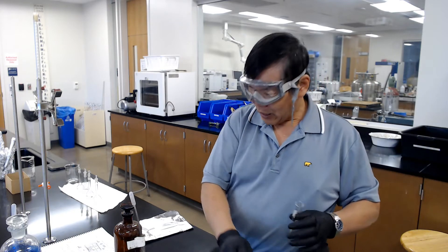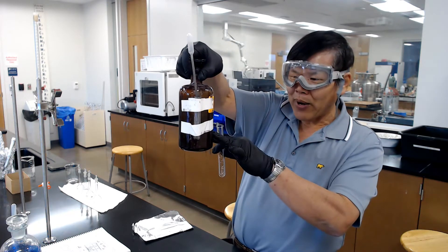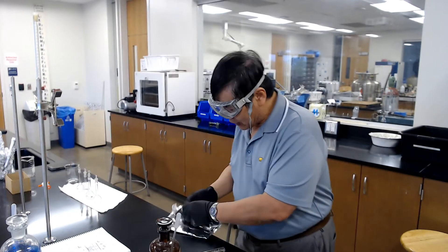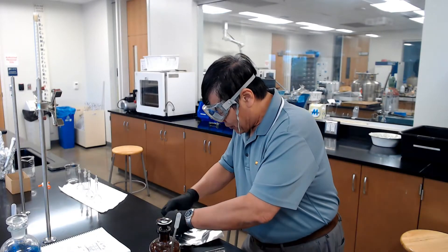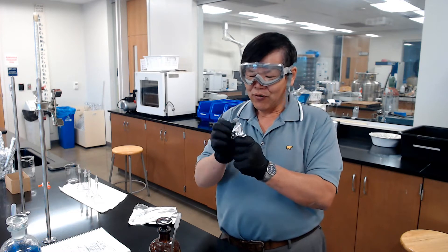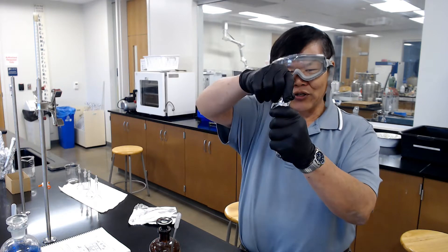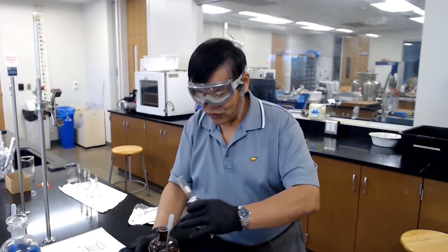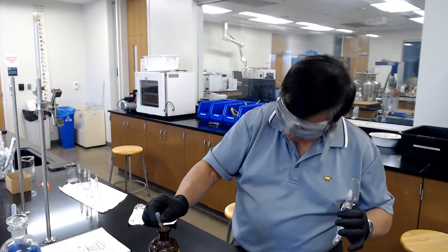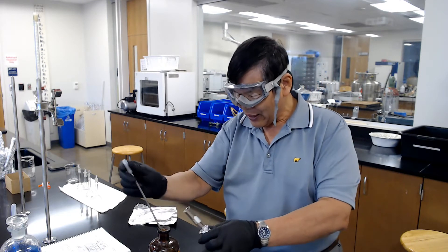Next, go to the hood where you have the bottle of silver acetate — it's in a brown bottle because it's also light sensitive. Before you put the solution in, make sure you wrap the test tube with aluminum foil because you don't want light hitting it. Then lift it up and put the pipette in — go to the middle, do not go to the bottom or the top where the dregs are.